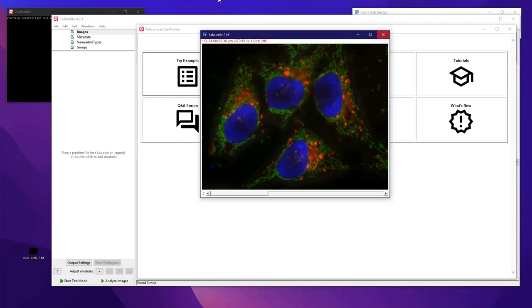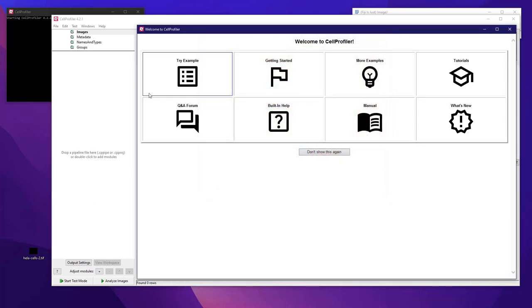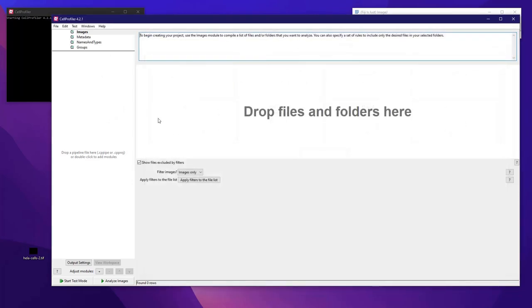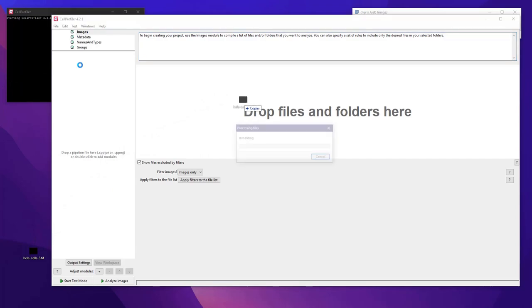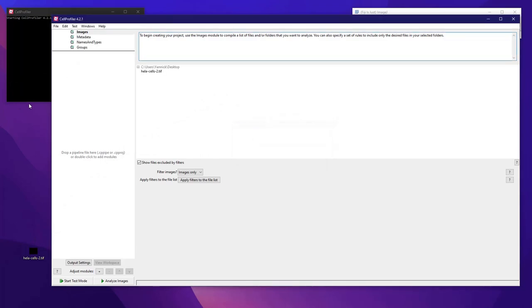When you launch CellProfiler, what you will see is this welcome screen here. You can try the examples, see the tutorials and manuals and so on. I will just close this window and start directly by dragging and dropping the HeLa cells image here. So that's the first step.